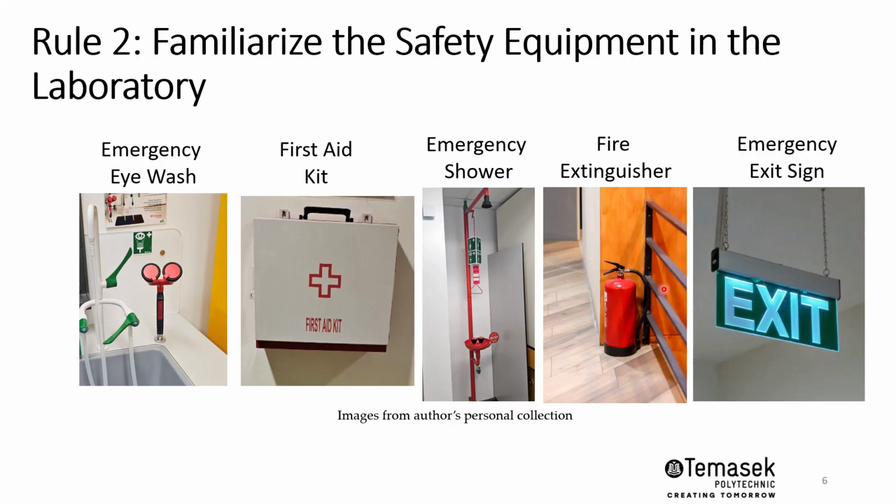For the fire extinguisher, know the location. These are typically good for electrical fire, or even for chemical fire arising from its usage. And finally the exit sign. Typically the entrance will be the exit, but do take note of these signages so that in the event of an emergency you will know where to evacuate.